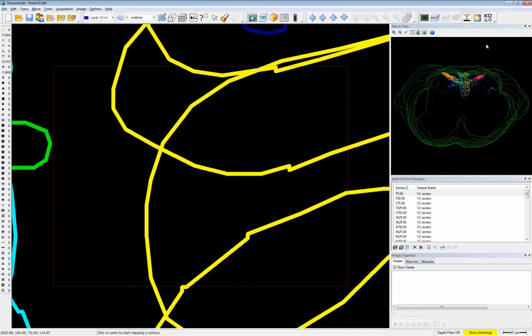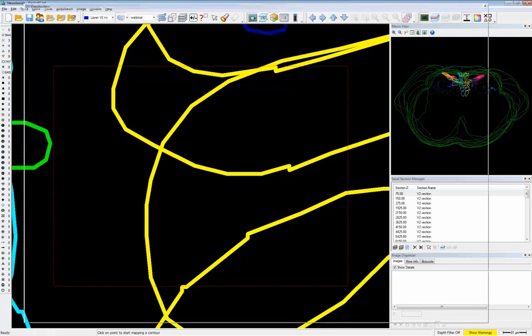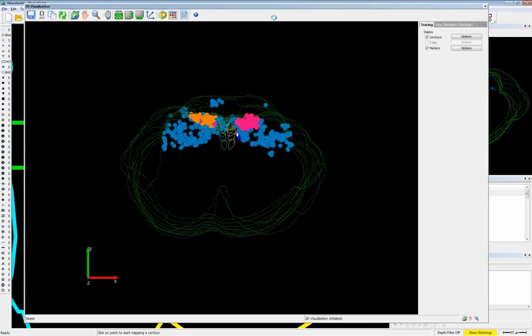And you can see by looking at the macro view that there are a number of sections outlined. There's a number of markers placed in here representing different things. This is neat and everything, but we really want to be able to look at it as it would be represented in the real world, as a cartoon. So here is the 3D visualization tool. You click this toolbar button and it will load the model in.